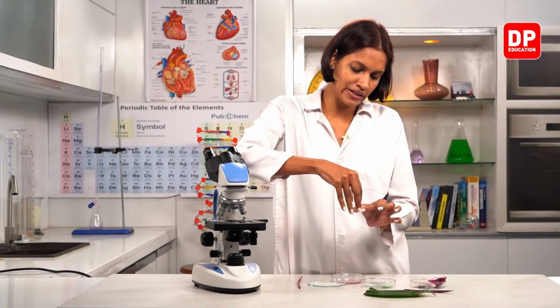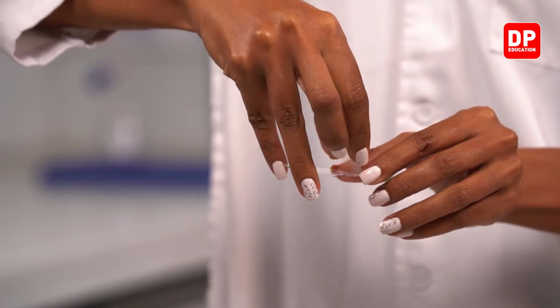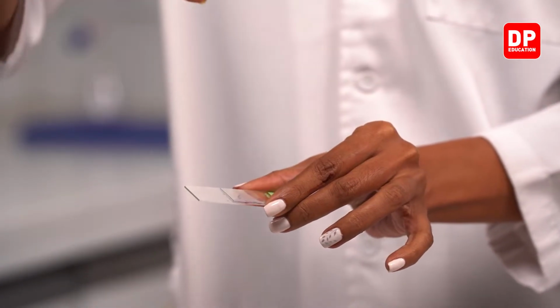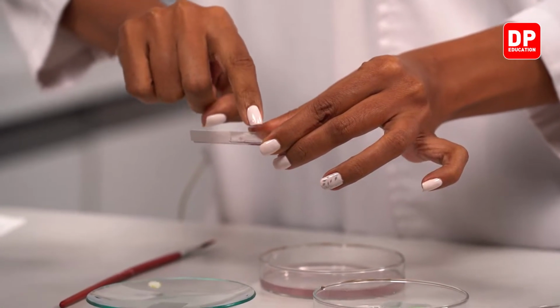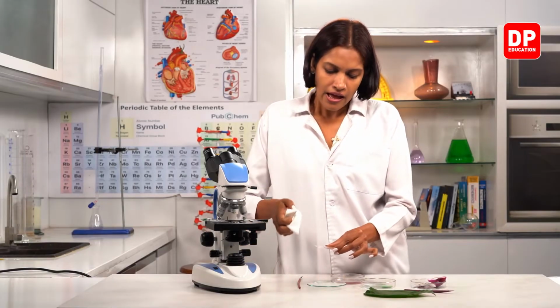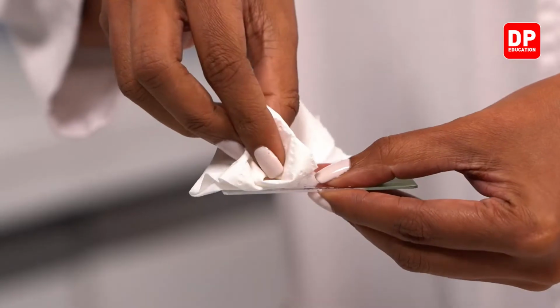Therefore, I'm going to hold it like this and hold it at an angle like this, and I'm going to drop it like this. And then we have to give a little tap so that if there are any air bubbles, they will go off, right? And then I'm going to wipe the excess water off this slide.